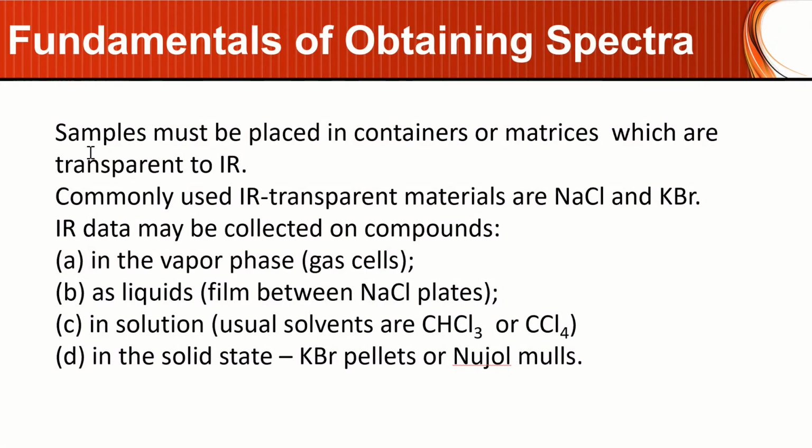So, samples must be placed in containers or matrices which are transparent to IR.